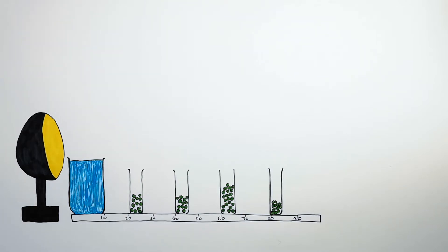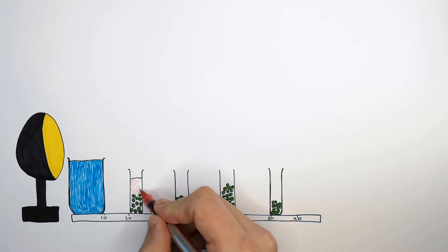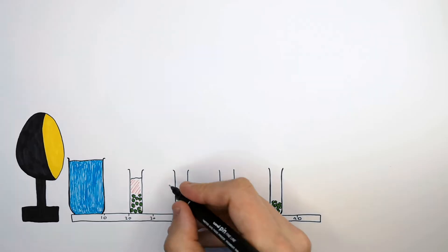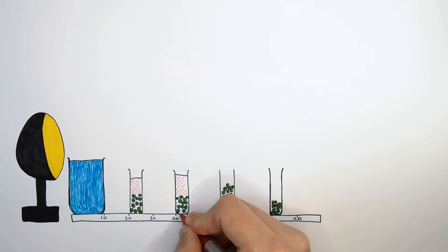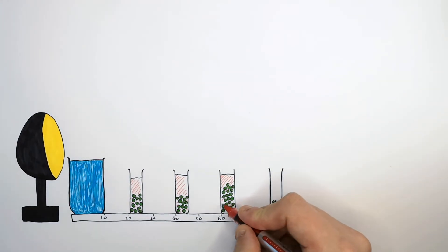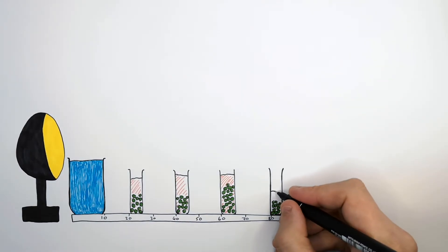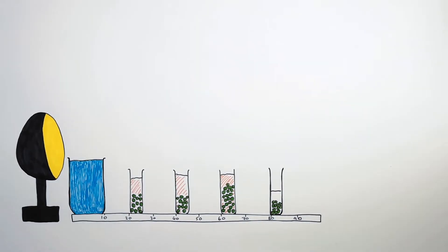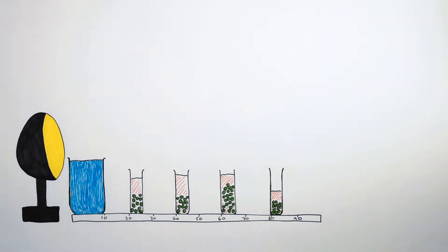We now need to add the same volume of hydrogen carbonate indicator into each flask — it must be the same volume, as this is a control variable to make your results reliable. The same volume of hydrogen carbonate indicator is added to the first three flasks. In the fourth flask, the student makes a mistake and adds less volume of hydrogen carbonate indicator, which could mean the results are not comparable. Then you put the lids on the flasks.